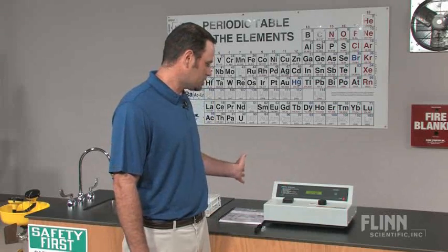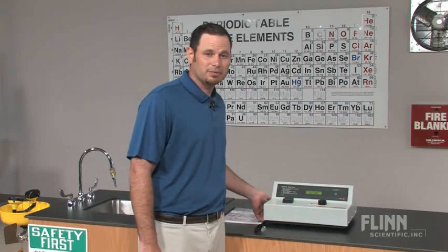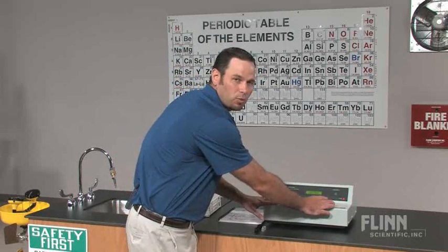Its durable and sleek design is chemical resistant and won't allow chemical spills to enter the unit. It has a built-in filter wheel that changes automatically when you move the wavelength knob.